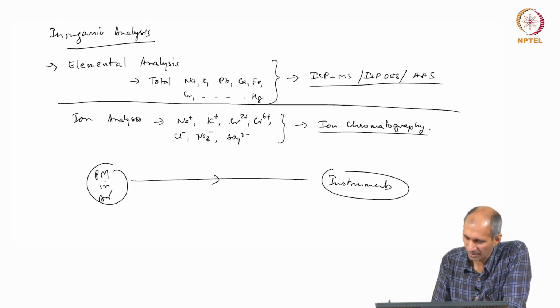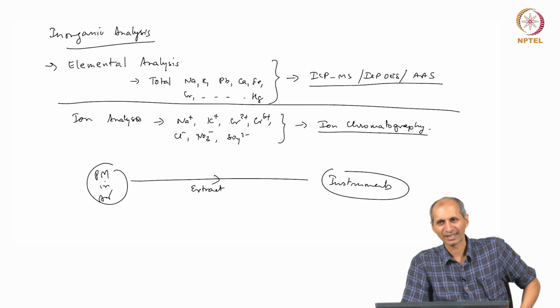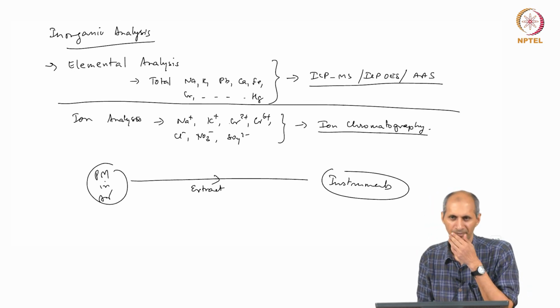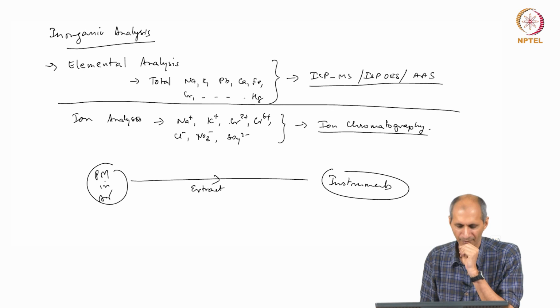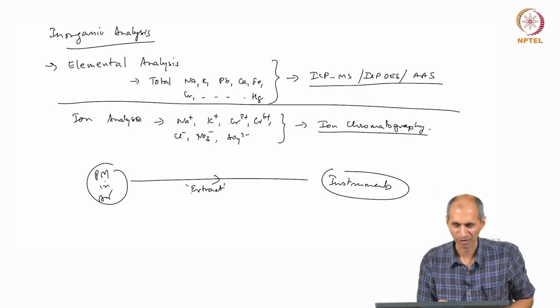On the other hand, if you are doing metal analysis, what is the extraction medium that we generally use? We have not discussed it. What do we extract metals with? Generally all elements, from high school chemistry. What is the material used for extraction of metal elements? What solvent, what liquid can we use? An acid. Which is the acid that dissolves everything? HNO3. All nitrates are supposed to be soluble.